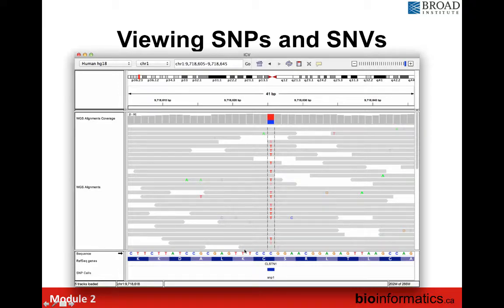You can notice as well some Ts actually have a darker red and some are lighter. This is a way to encode the base quality. So if you have strong T letters or A or C letters, you would trust it. If it's not as strong and is a blend or fade, I'm not sure how to call it, you would say, oh, actually I would not trust it as much as this one, for example.